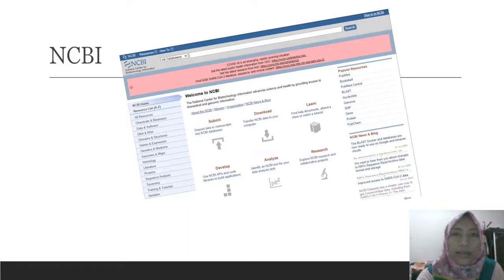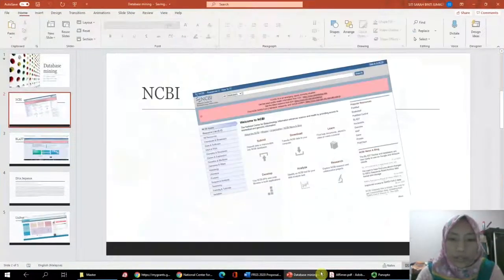If you are looking for an unknown gene, what you can do is take several related genes. In my case, I was looking for a strictosidine synthase in Mitragyna, which had never been found at that time. So what needs to be done is you need to find lots of genes that are close to Mitragyna and align them and see where they meet. From the meeting point, you should be able to find a specific place with a conserved region. So what is a conserved region? I'm going to show you afterwards.